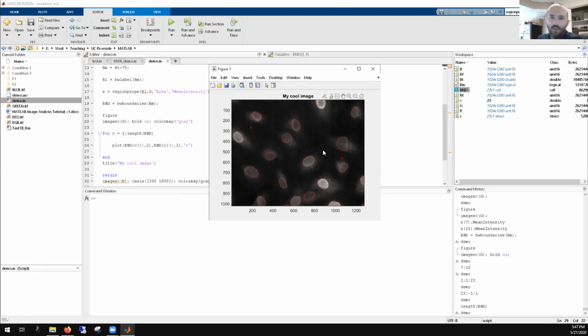Oh, the reason why I like grayscale better, and this is actually a really good question, is because grayscale is linear. A small change, like the increase in intensity between 377 and 383 and 359 and 503, is linear with how it's displayed on the screen. So as the image gets brighter, that corresponds linearly to an increase in intensity.